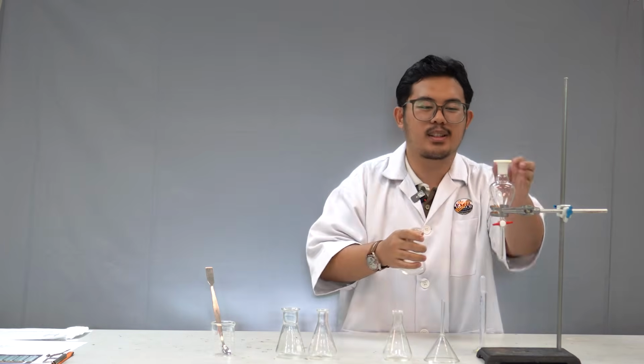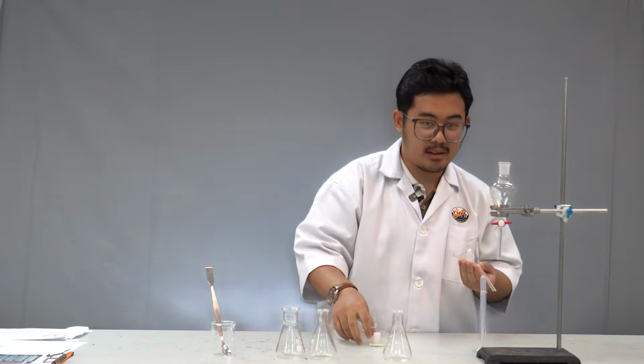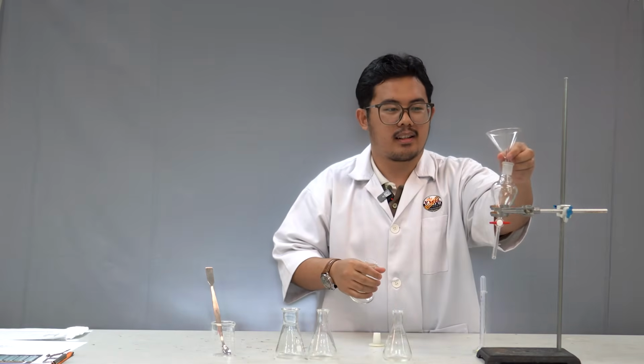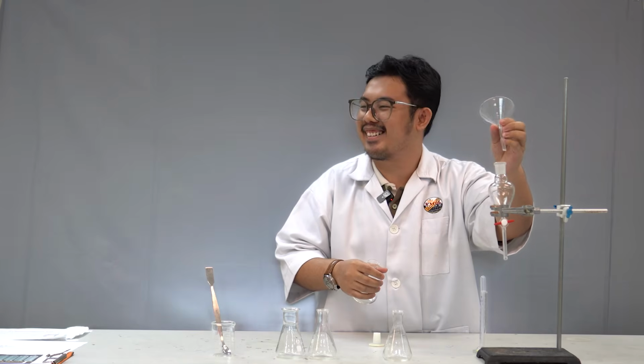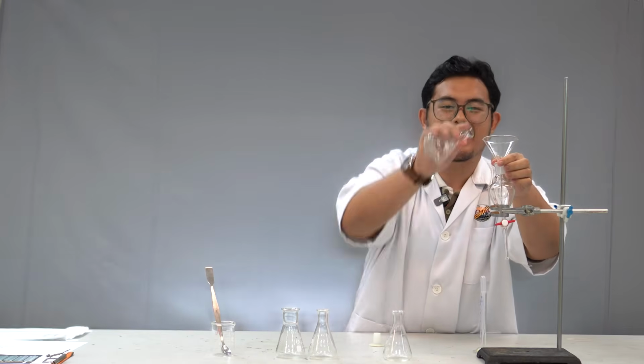So we pour them into this separation funnel, and remember, use a, what is this called? Filter funnel, correct, thank you. Filter funnel, and we pour them into the separation funnel.